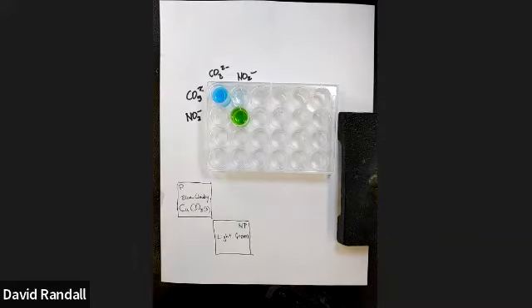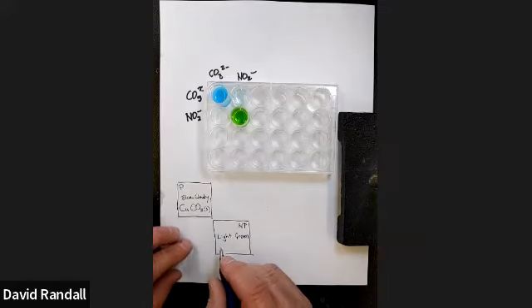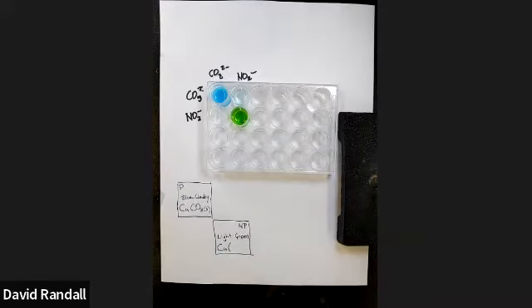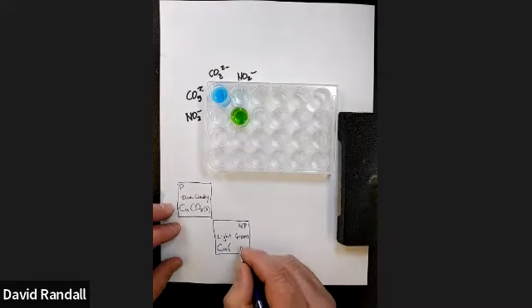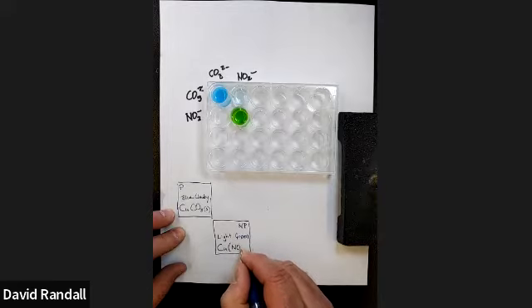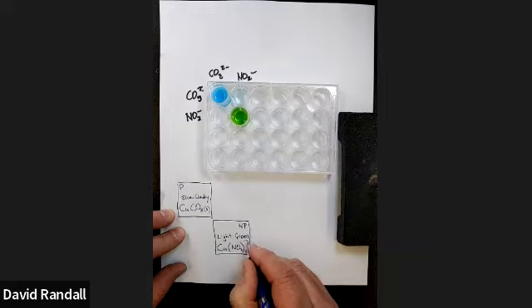Because no precipitate formed, I know it made a complex ion. The complex ion has copper, and copper always forms complex ions with 4 electron groups. Each nitrite donates 1. So there's NO2 minus, like that, and there'll be 4 of them.